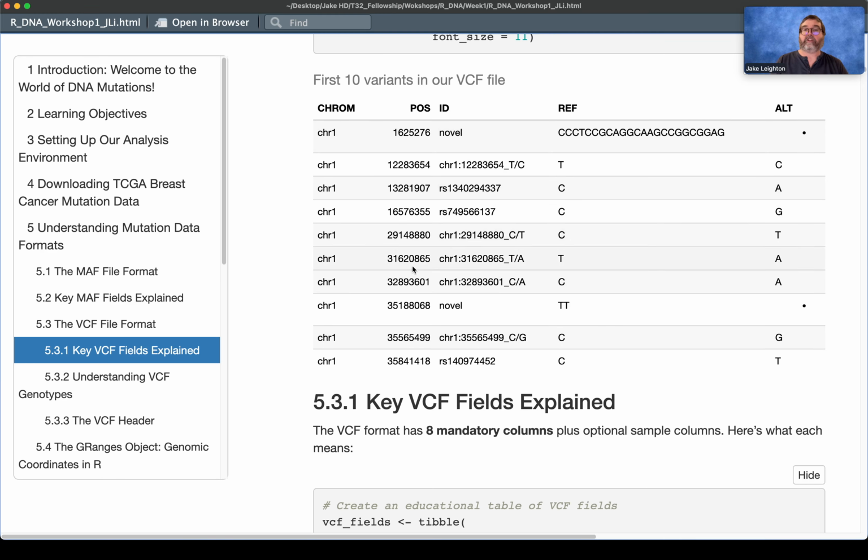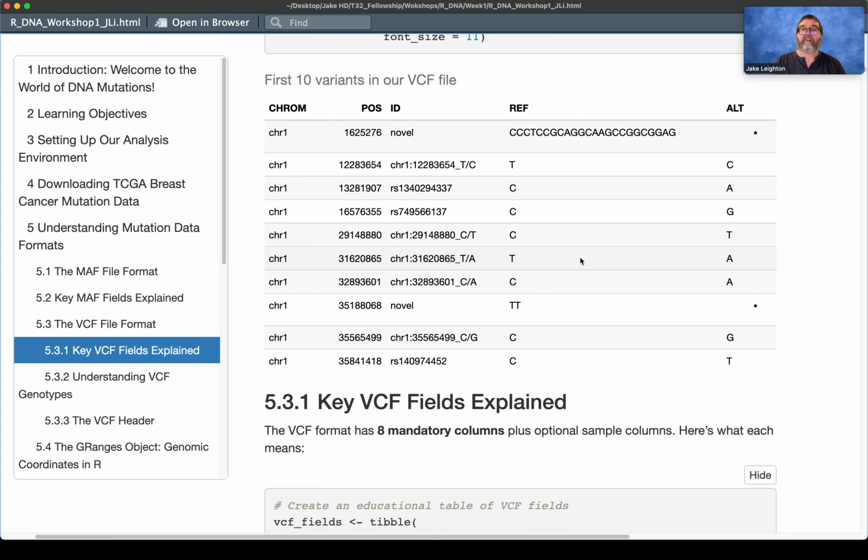So you see this is just the VCF file like we showed above. There's the reference allele, the changed allele, and we have our specific location, right? So instead of having the gene names, we just have the IDs. We don't have the gene names yet. We just know chromosome 1, this location, T to C. So remember, that's very general. The MAF would tell you the mutation and also tell you more, right? If it's a missense, and so forth. So this is just very raw data.